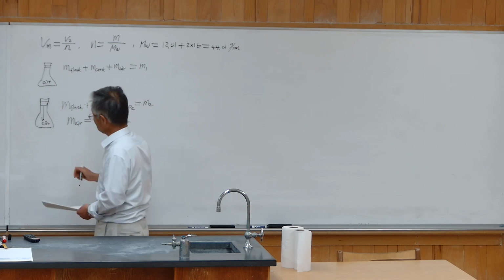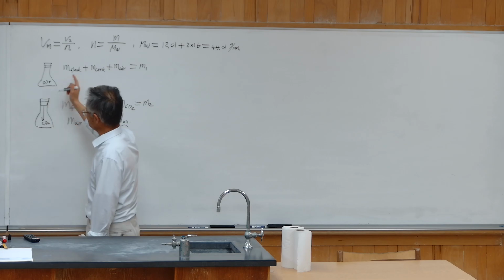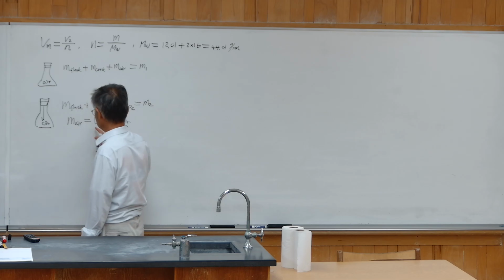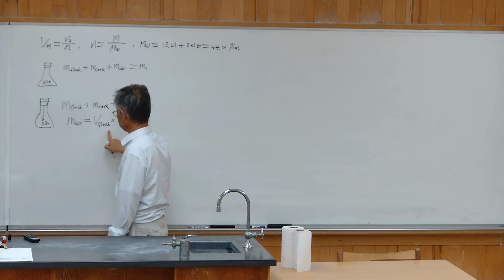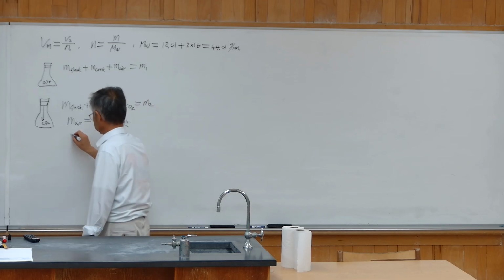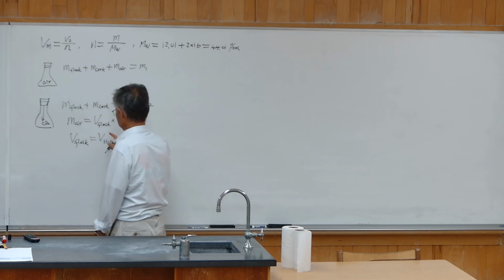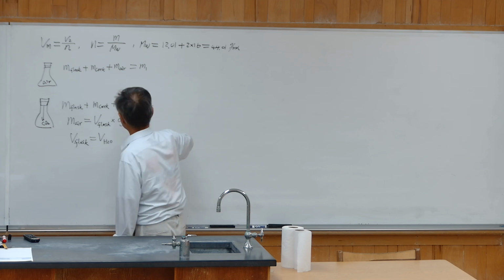After this carbon dioxide evaporates, we cork it and label this position. Then open the cork and fill in water to here. Then the water's volume equals the volume of the flask. Then from the water volume, you get the volume of the flask. Then from volume of flask times the density, you get air mass.